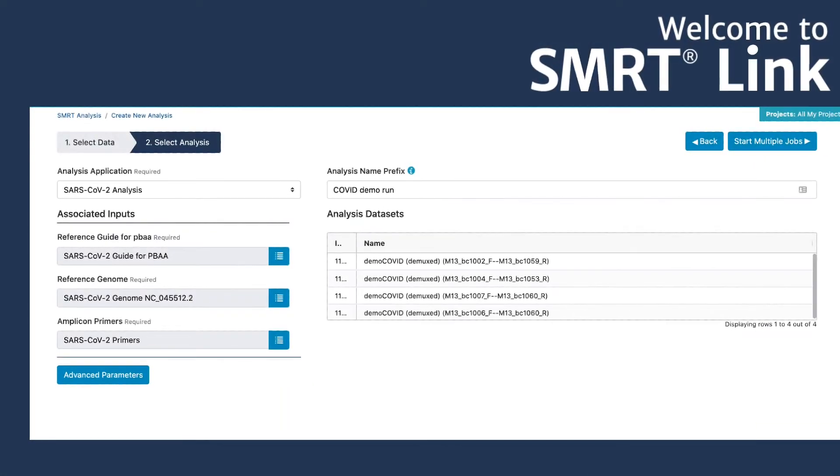Input to the SARS-CoV-2 workflow is a collection of HiFi reads, where each HiFi read set represents a sample. This collection could come from either the demultiplexed output of a single SmartCell run or multiple runs.